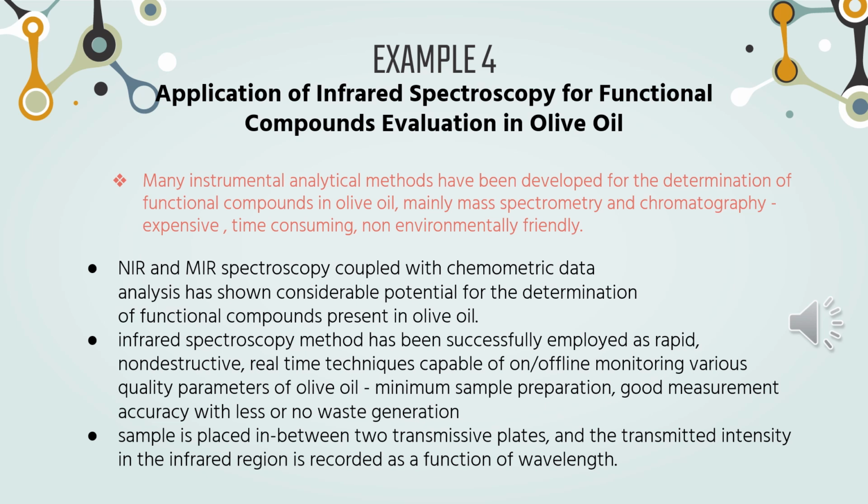Infrared spectroscopy has been successfully employed as a rapid, non-destructive, real-time technique capable of on or offline monitoring of various quality parameters of olive oil. The advantages of this method are minimum sample preparation, good measurement accuracy, and little or no waste generation. The sample is placed in between two transmittive plates and the transmitted intensity in the infrared region is recorded as a function of wavelength.